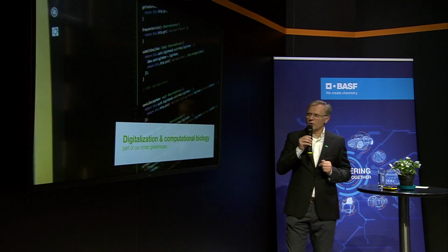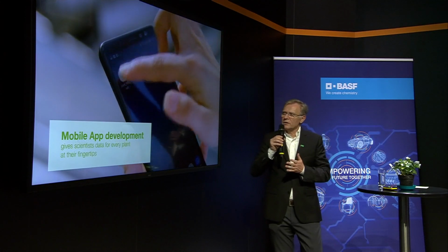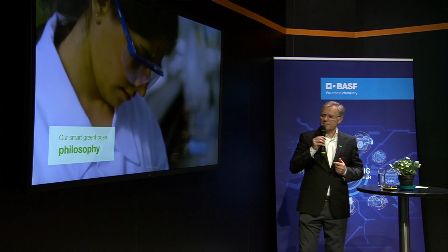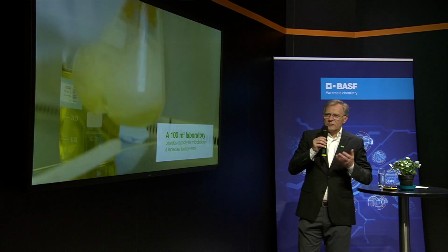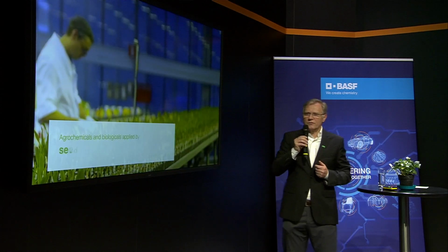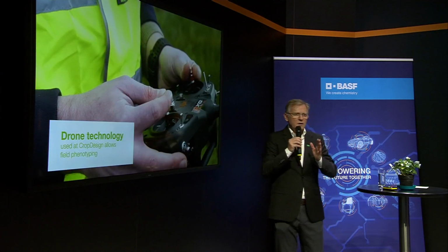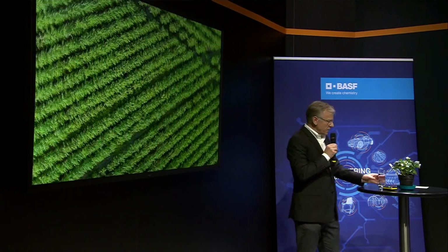This is very interesting because some of the features are linked to the feelings, or the physiology, of the plant. We are developing tools that help scientists go a little bit deeper into the history of the plants as well. So smart greenhouse technologies is our philosophy. The treatment of the plants during the experimental phase depends on the scientific question. It can be treated with chemistry or with biologicals, and only one activity, which you see here, is done manually. It is the sowing of the plant. All the rest is automated. Of course, it is a technology we use for field phenotyping as well.